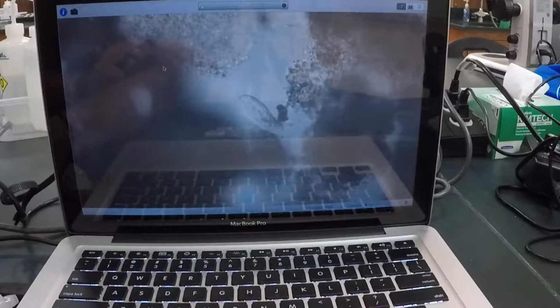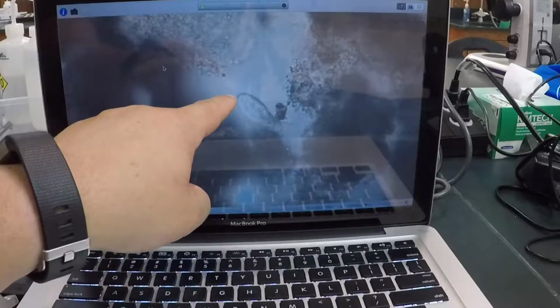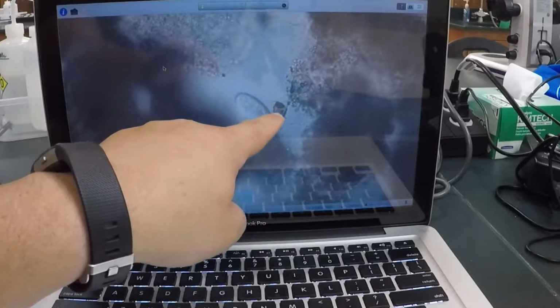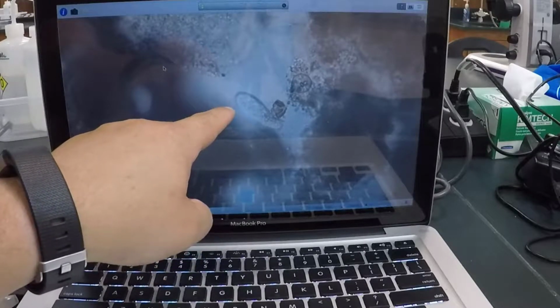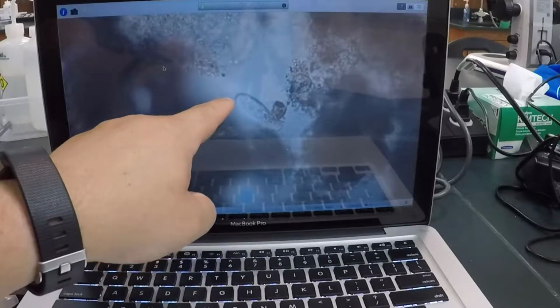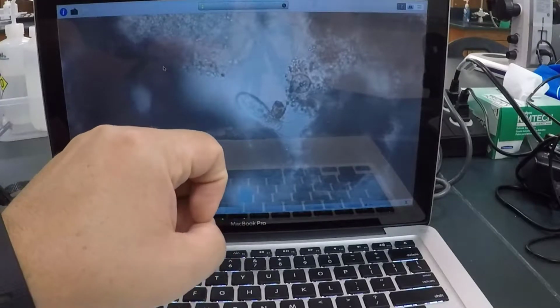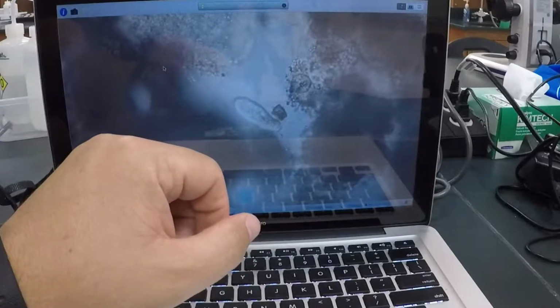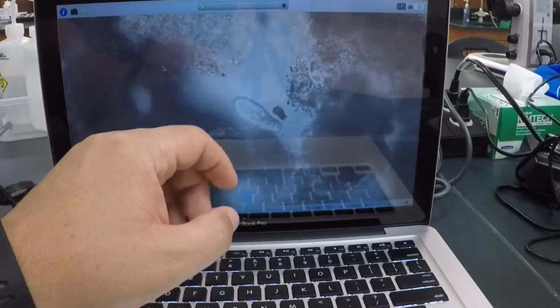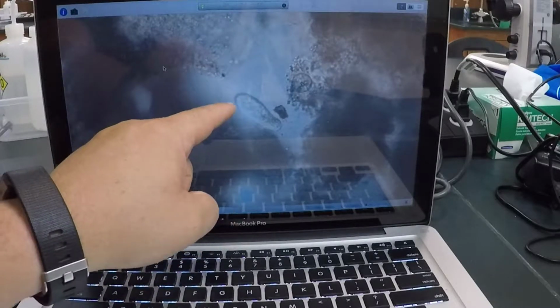So that's another paramecium. When I focus in, you can actually see the cilia, the little teeny hairs moving along the side of the body of this organism. Okay, and that's a good way to distinguish paramecium from something like euglena. Euglena will also have kind of a green tinge to it, but also Chilomonas will have two flagellums. They won't have cilia. These guys have cilia, paramecium do.